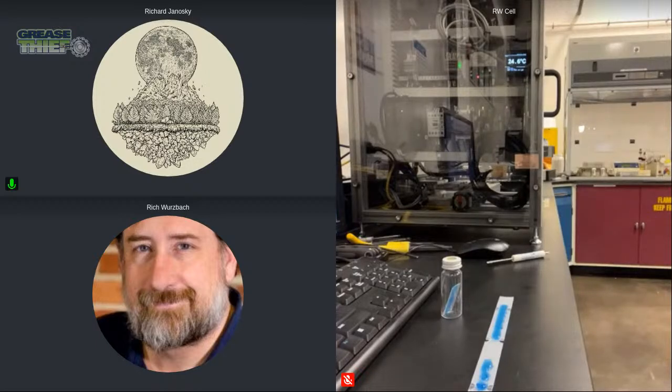The grease thief colorimeter is being included in the study. And there's a few other ones. The ruler's being included in the study, as well as dye extrusion, particle count, and moisture. With moisture, there's quite a few because there's many different ways of doing it out there. So we'll have Karl Fischer, Vapor Pro, and I want to say there's one other way that a laboratory said that they were doing grease.